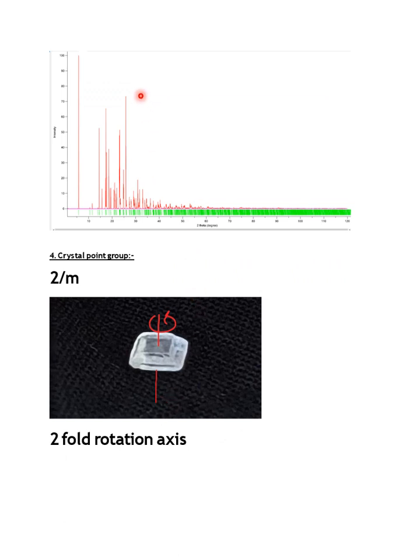And again, this is the PXRD simulated powder X-ray diffraction pattern that we obtained for the third dataset by using the VESTA software. So this was the complete report of the 3 datasets that we were given to analyze.